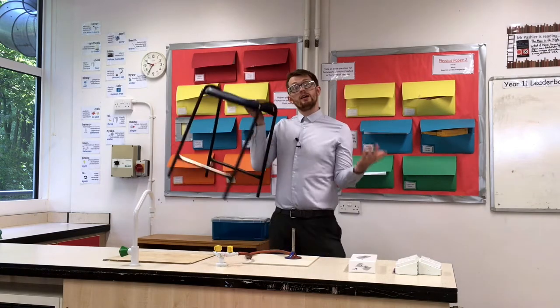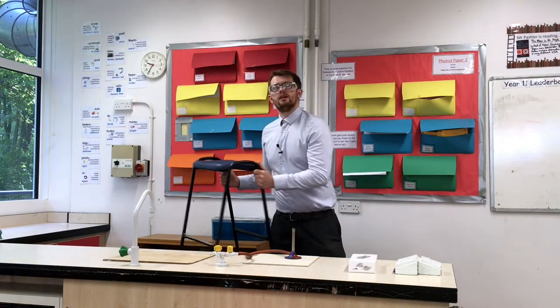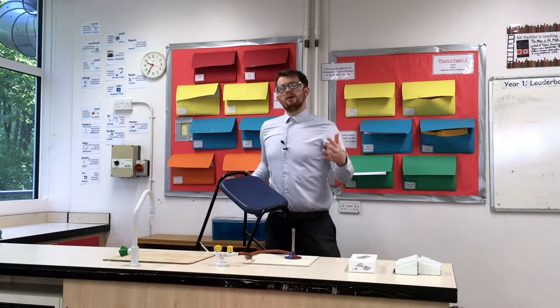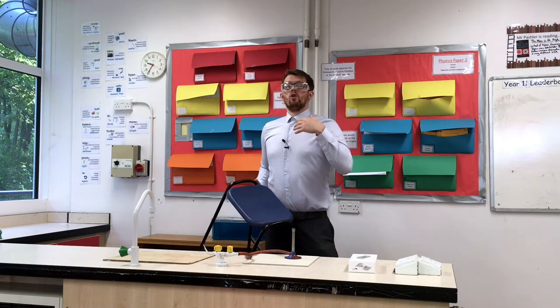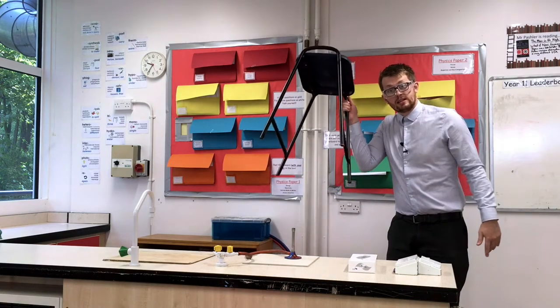Another big no-no is the stool — don't sit down while you're using a Bunsen burner. Make sure it's tucked neatly under your desk. This means that if any hot liquids spill or if anything goes wrong, you can step out of the way nice and easily. Don't sit down.